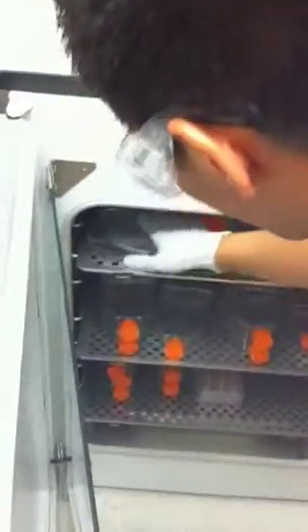And now let's move it. Let it go into an incubator. Wait about 5 to 10 minutes.